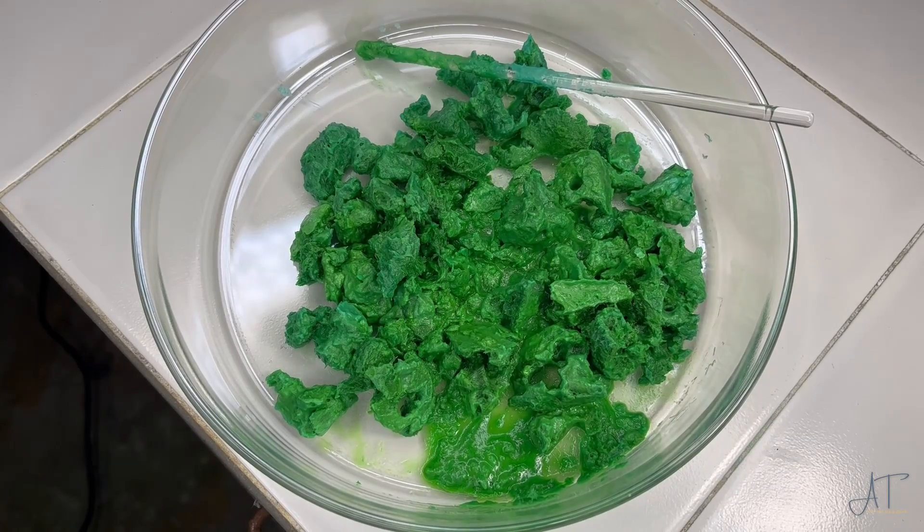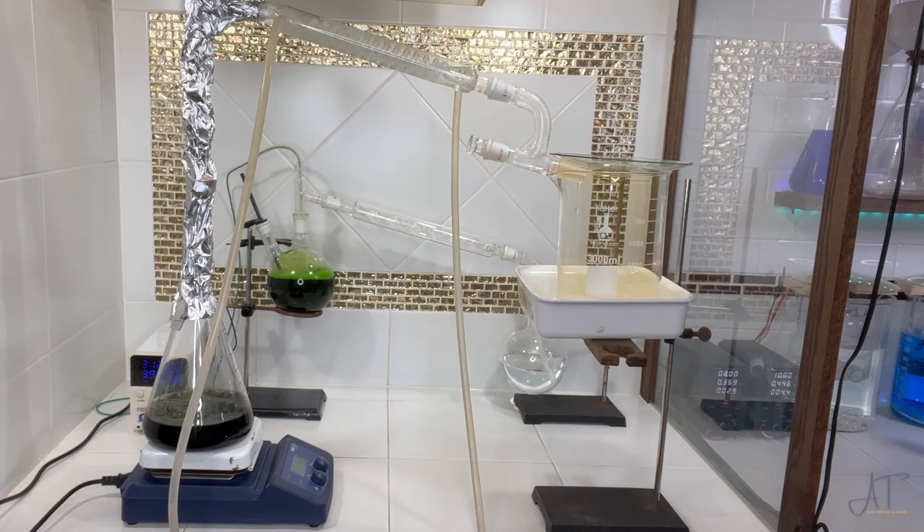What form we want our metals in this time will be in a chloride form. I'm going to show two experiments that will remove hydrochloric acid from aqua regia. The difference is one is much more controlled and the other is faster.